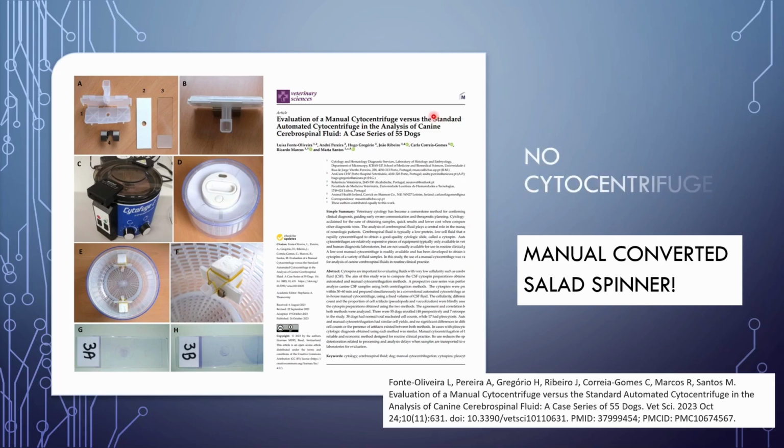I love this paper. This is where they've taken the sort of system for going down onto a slide here and put it onto a salad spinner and done it manually. And this particular paper compares those results, and the study found that they were comparable. So there are ways of doing it in practice, which can be quite important because those cases don't necessarily keep laboratory hours. If you want to analyze a sample over the weekend, for example, then the lab is not going to be open.